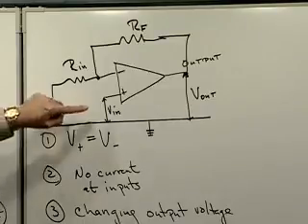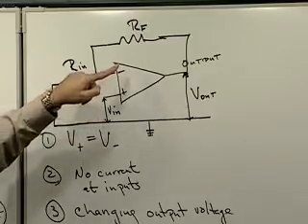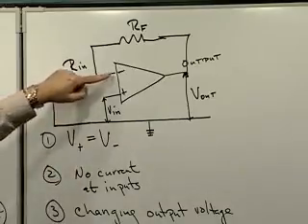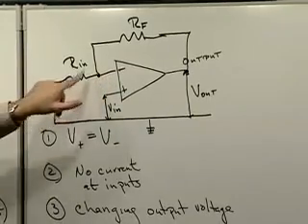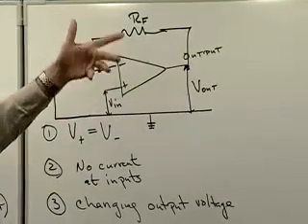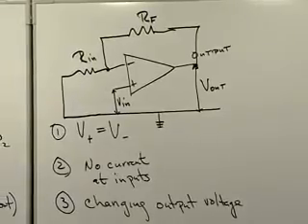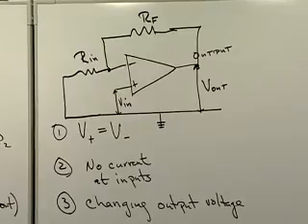And whatever voltage we apply over here has got to show up over here because of this first rule. So we're going to generate a voltage over here by applying a voltage over here. And that will generate a current because we're taking that voltage through some resistors. And so we have a current that we could associate with that. And we're just going to follow Ohm's law and Kirchhoff's rules and all that wonderful stuff. And I don't think we're going to get too concerned in that because that goes back to freshman physics, and you probably remember that somewhere way back when.